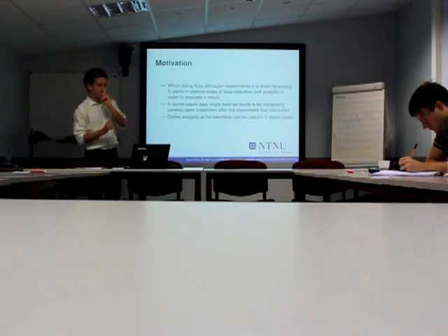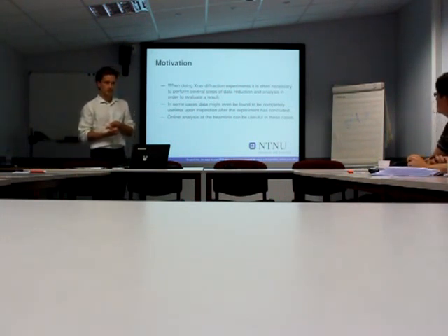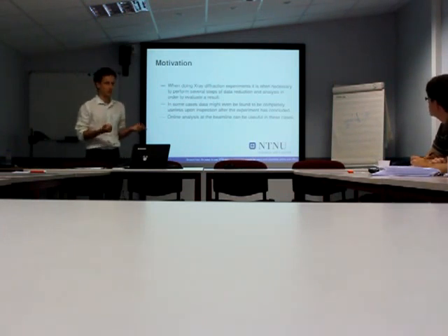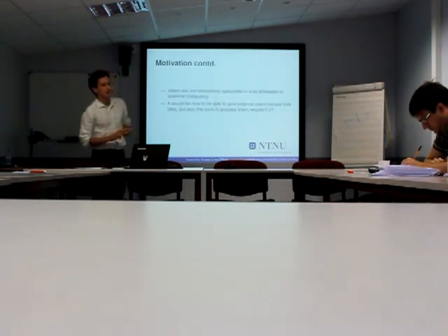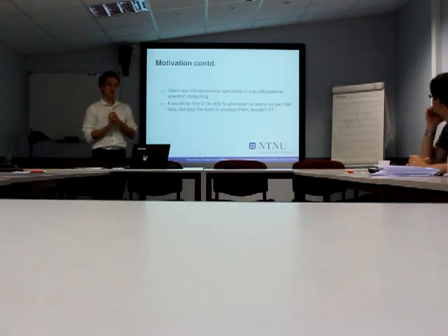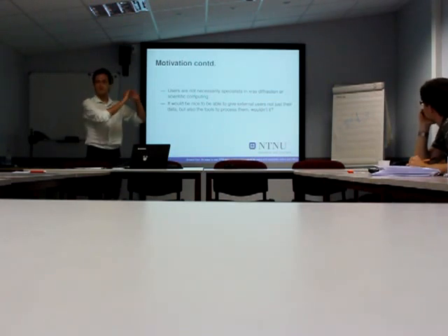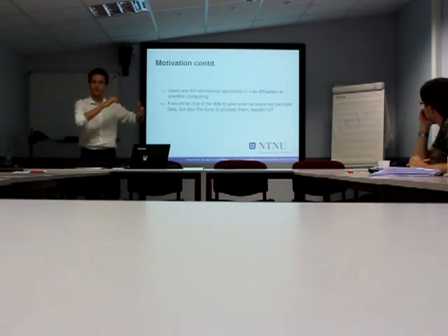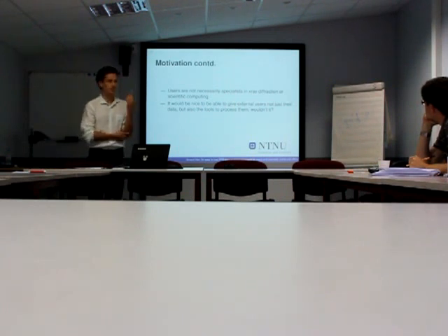Now, for this to be feasible, you need some software that is quick and easy to use, and it should be reasonably fast. But it doesn't have to be published-grade quality of the data, just get some quick and dirty overview. In addition, it would be nice to not only give the users their data, but also some tools to process it all the way from calibrating your detector for tilts and so on, doing the azimuthal integrations, and the rest of the workflow that your particular experiment might need.